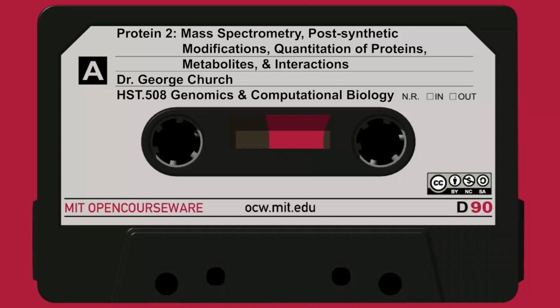So both of these together are two very high-resolution methods, and you can think of trying to divide a complex protein mixture up into a lot of separate bins, maybe 100 of each. And if you combine two dimensions, as you often do here, where you'll run first isoelectric and then second the SDS dimension, now you get 100 bins in one dimension, and each of those bins turns into 100 bins in the second dimension. So theoretically, you get on the order of 10 to the 4th bins. And if some of the rare proteins you want to analyze are in one of those bins, you might have gotten as much as a 10 to the 4th fold enrichment for those rare proteins away from the more common ones, which are all too easy to stumble upon.